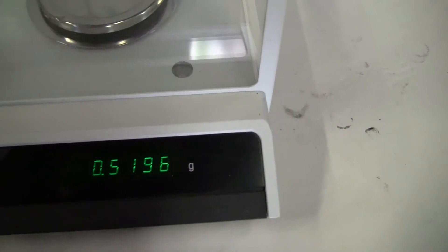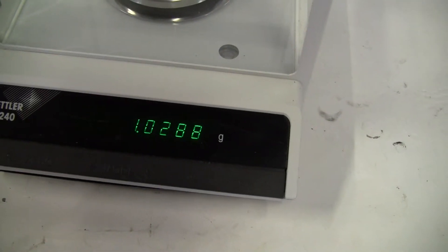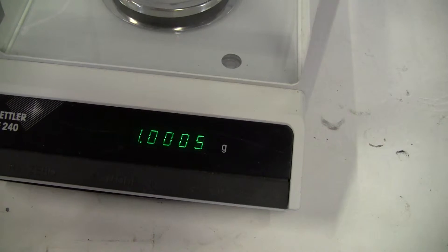Put something small, like a 1 gram. There we go, 999.